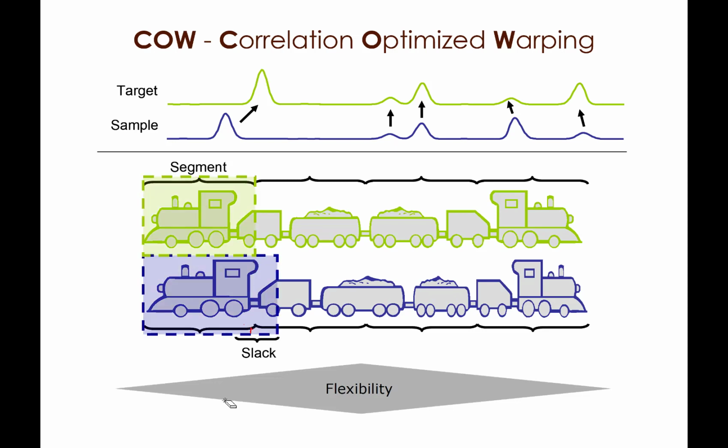So you can see if I would call this time 1 to 10 and I call this time 1 to 10 and then interpolate my data appropriately, well then I actually have aligned my data. That's basically the idea in correlation optimized warping, or COW. And the goodness is measured by how well the two signals correlate to each other.